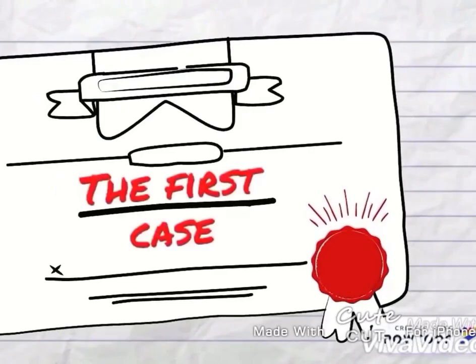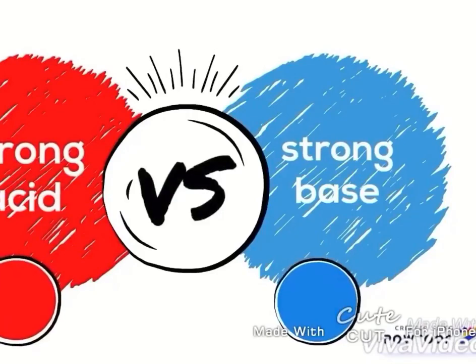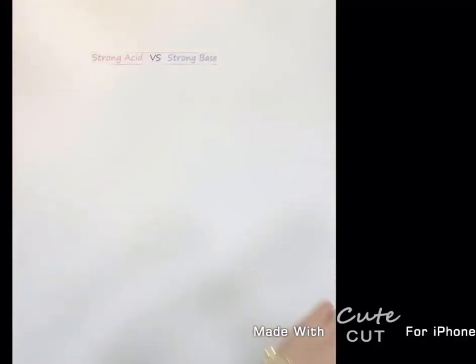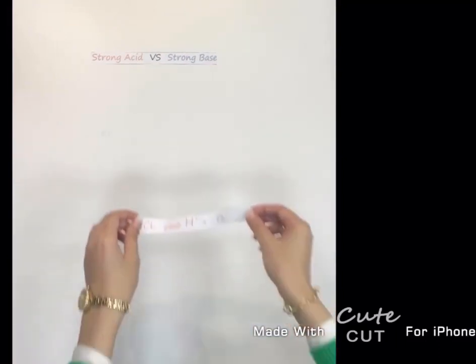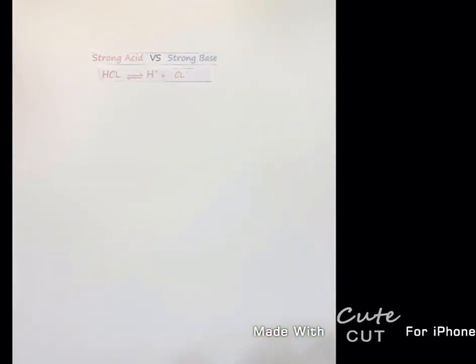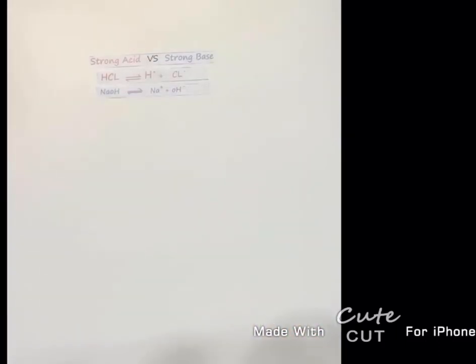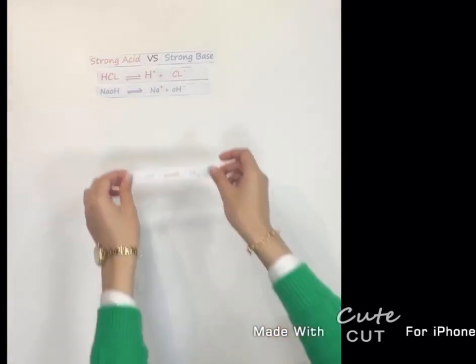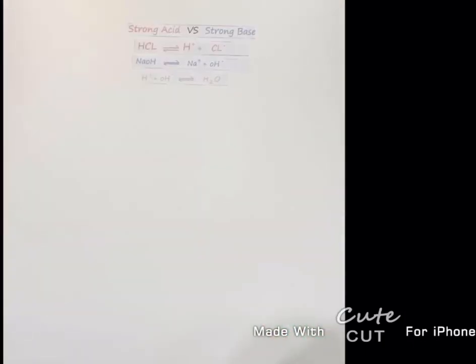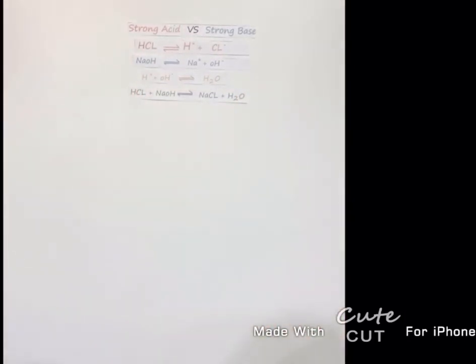The first case is strong acid against strong base. The strong acid will be hydrochloric acid, which is completely ionized, and the strong base, sodium hydroxide, which is completely ionized too. After adding hydrochloric acid to sodium hydroxide, water will be formed. And due to the reaction between sodium hydroxide and hydrochloric acid, sodium chloride salt will be formed. And this is the overall equation.